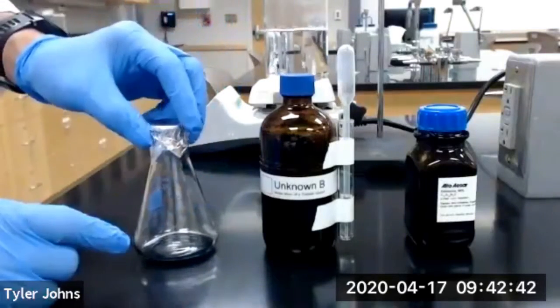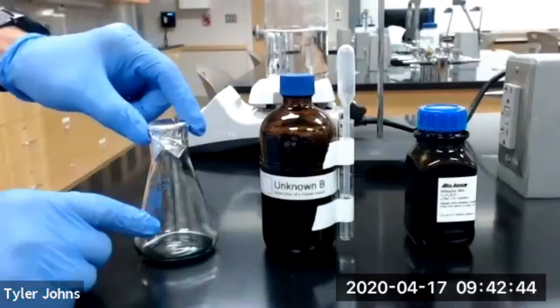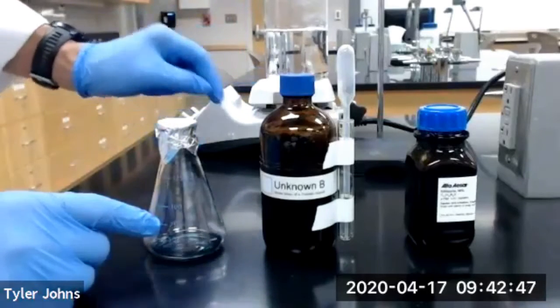So the next thing we're going to do is clamp this and lower it into our boiling water, which is back here.